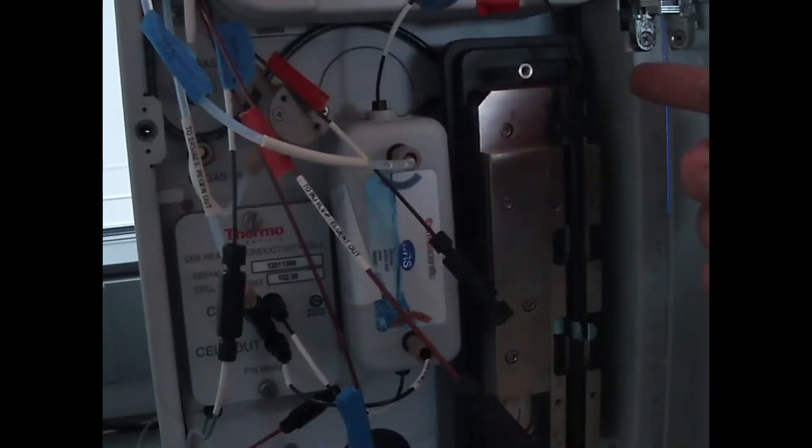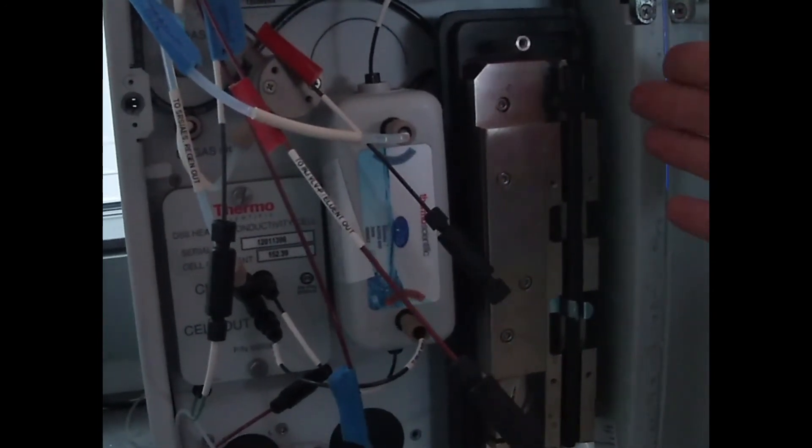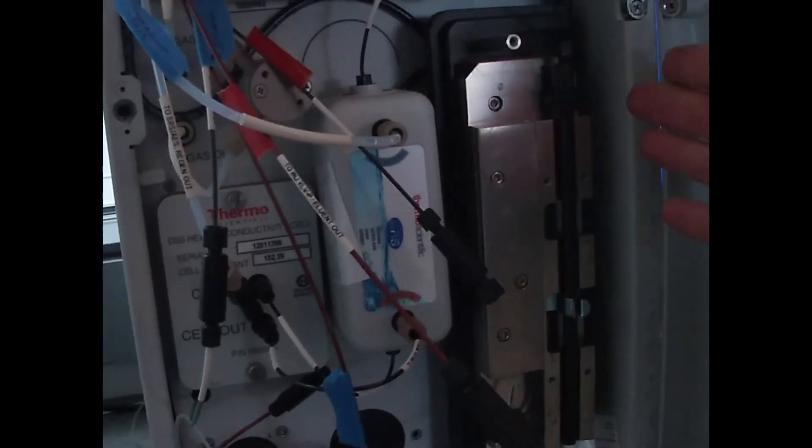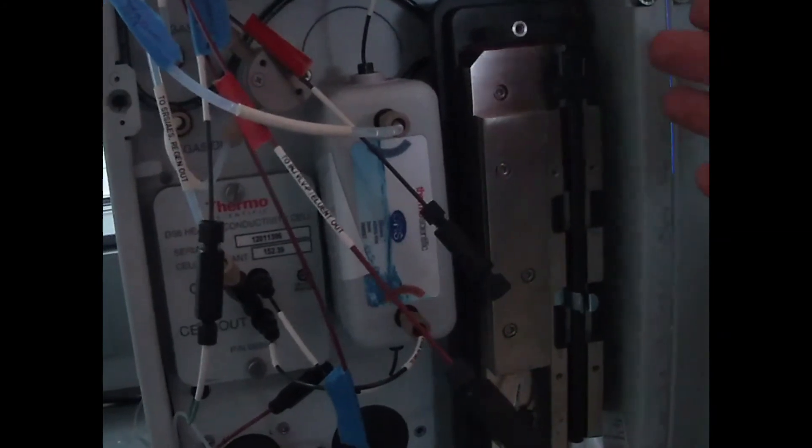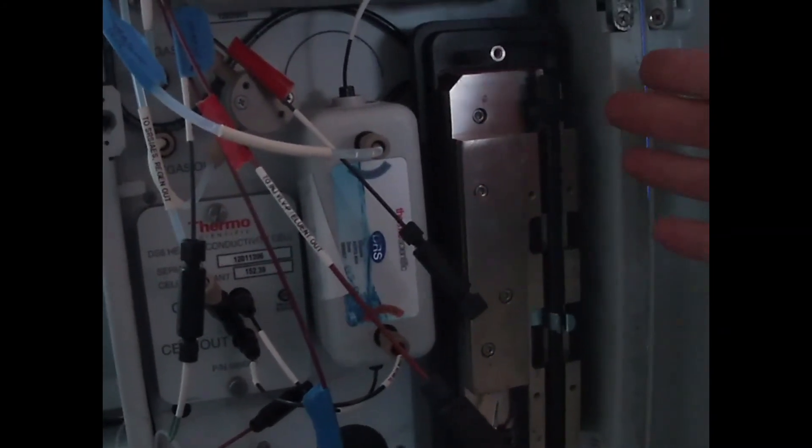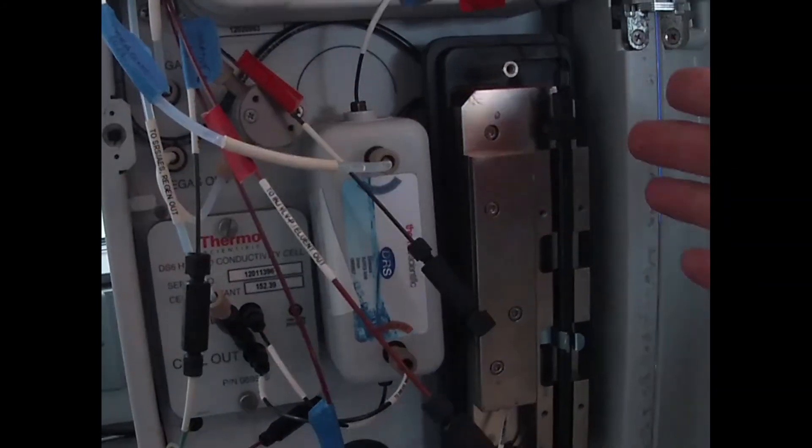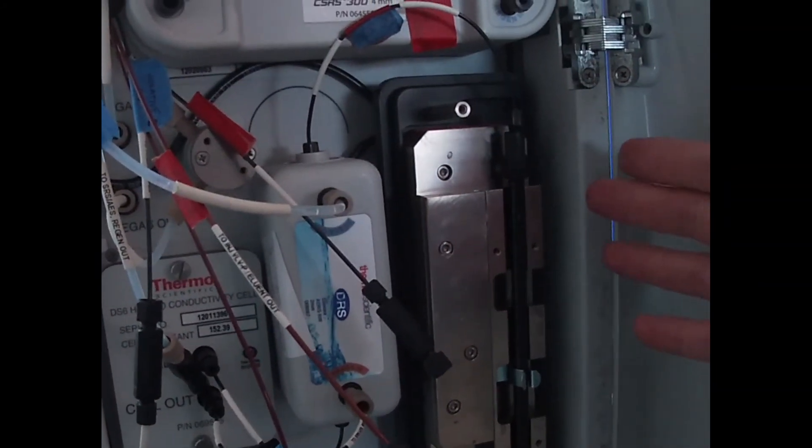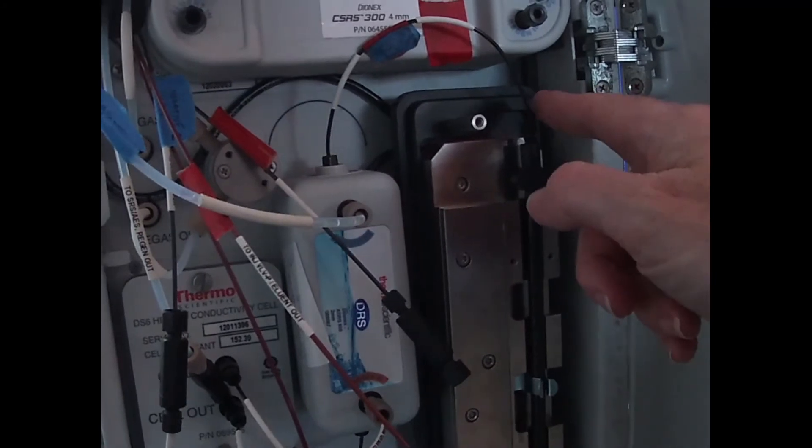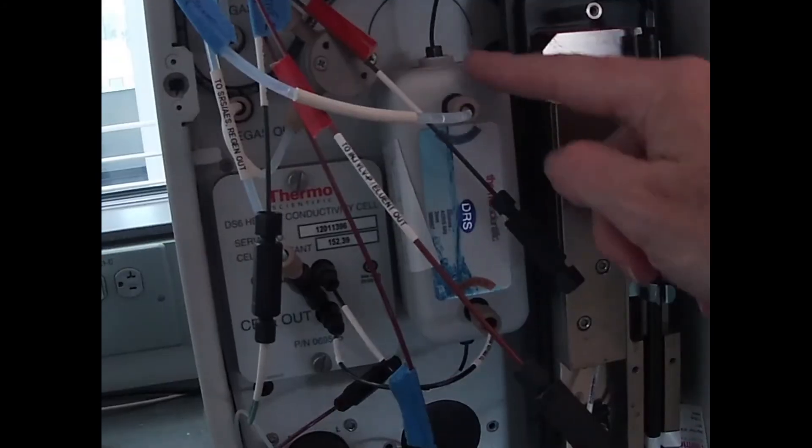So then the anions, say sulfate, would now be sulfuric acid, or nitrate would be nitric acid. Any phosphate coming through would be phosphoric. And so those remain highly conductive. They remain strong electrolytes so that they'll be detected readily by our conductivity detector.